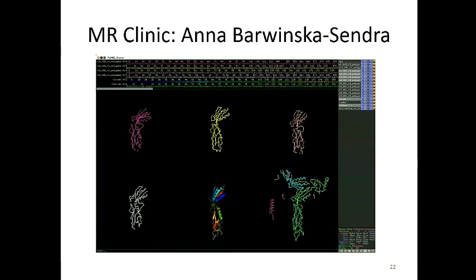But as we were looking, it was really quite educational. The cases in the MR clinic, some of you will have seen this over lunch, and thanks to Anna for allowing me to show this structure. So you might remember Anna's case had 2 domains, which were reasonably high sequence identity, but kind of awkward, and Rona managed to solve it by splitting into the 2 domains. When I ran this past the Concord approach, Concord generates structures where the 2 domains have different angles with respect to each other.